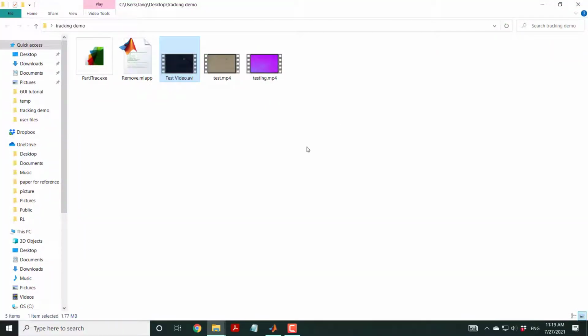Okay, and sometimes even in the worst cases, you could have an image something like this. So I have a very, very bad result, a very bad image, and there are a few particles that are actually moving well. A lot of them are not. So it's really impractical to do anything out of this one. Okay, so today I'm going to show you how to do that.